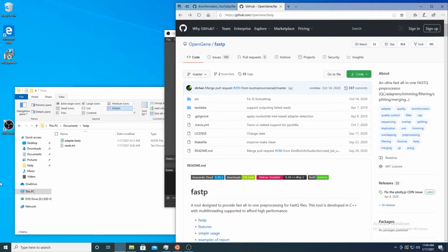So I've never used fastp before, but some people that work in the same lab as me have used it before, and they find it extremely helpful. It's really useful for filtering out low quality reads, trimming, and removing adapters, which is what the people I know use it for. It can split files, merge files, etc. Today I'll be doing a quick run through of it, as I found it pretty interesting and also really handy.